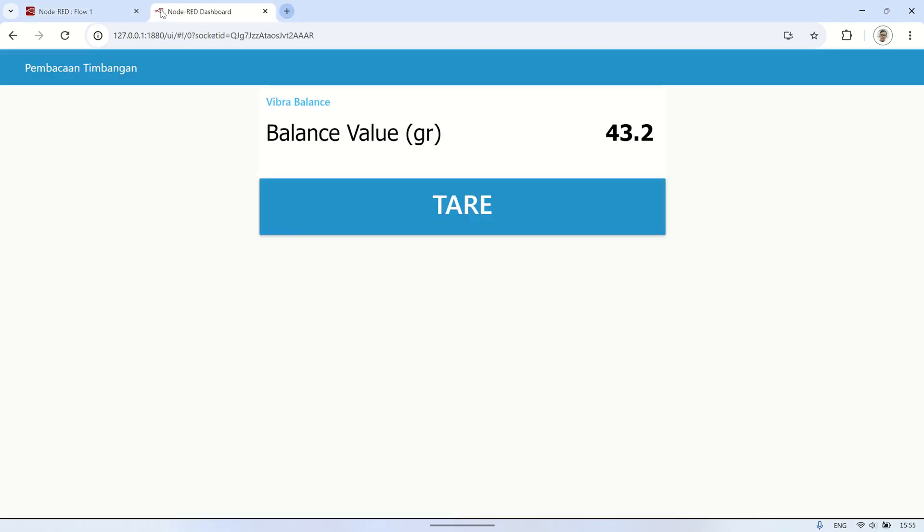This is the Node-RED dashboard which will display the balance readings in real time on the text node and includes a tare button that will perform a tare on the balance when pressed.